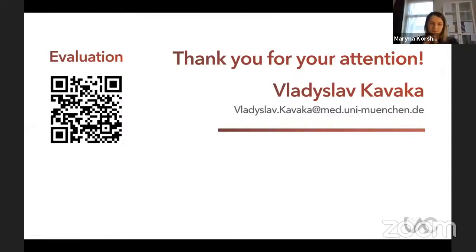I tried to answer that question in Slack already. As per the settings of our QA session, it will be summarized questions and the replies in the thread. But in brief, to make a recap, from my point of view it is quite tricky to do the validation of bulk experiments in single cell, because in single cell you actually approach single resolution and try to observe the processes which happen in every independent cell. So quite often you do the opposite approach: you analyze something on single cell, you might also capture your cell of interest into one group and then do bulk sequencing of that, because bulk sequencing on average has more statistical power.